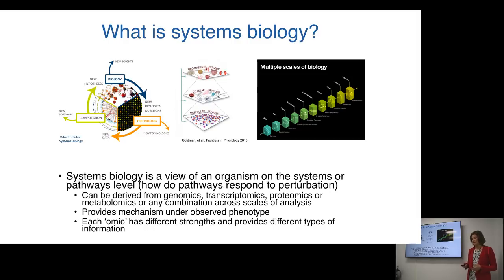Traditionally, people have been using more genomics or proteomics-based techniques, but our lab has been pioneering the incorporation of metabolomics into systems biology workflows, where we use metabolites to identify the key pathways that are connected to the phenotype that you are observing in your system. And this can be any type of biological system that you're interested in, from bacteria to humans and everything in between.